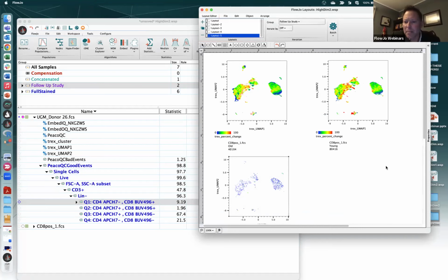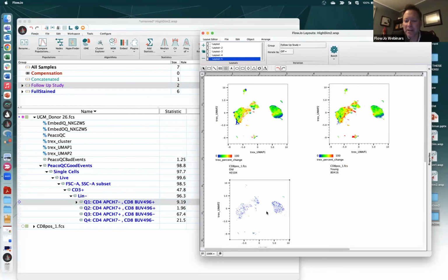And we would look and say, does it have a lot of cells on the left side of this? If I had to guess, it does not, it appears. It looks like a small population there, but we would test this. And so maybe this is more like the sample from an old person, perhaps. Old, relatively speaking. Older than young people, that's all. Okay, but anyway, you can see exactly where those cells fit in.